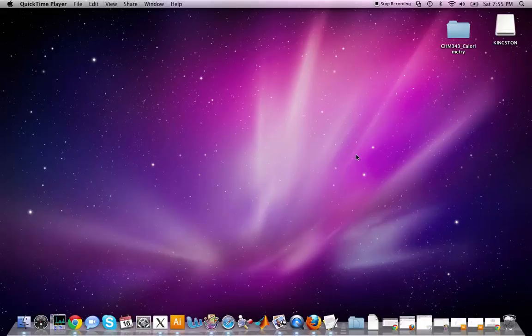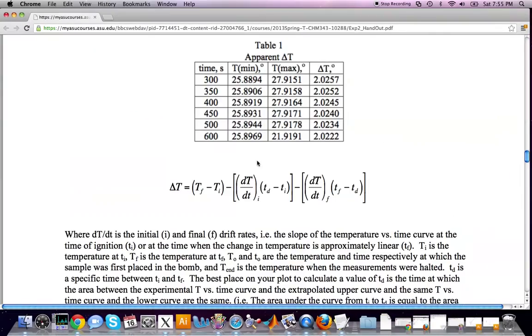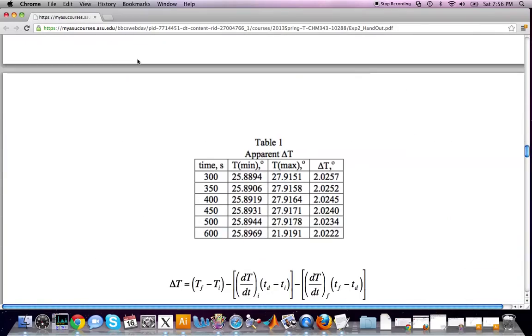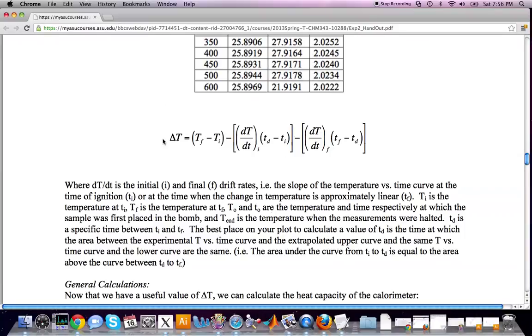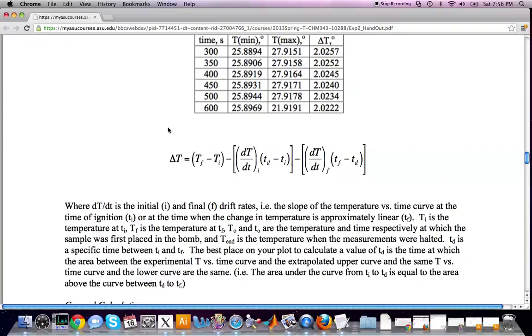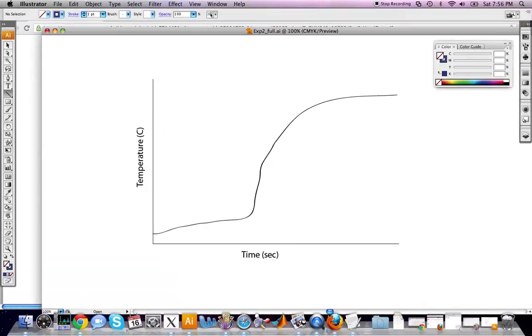Hi everyone, this is Steve Davidovsky, Chemistry 343 TA here at Arizona State University. In today's screencast, we'll go over how to find delta T when doing a bomb calorimetry experiment. You'll recognize this is the lab handout provided at the beginning of the experiment, available on Blackboard. Scrolling down to the section called Determining Delta T, you can see the equation for delta T. I'll go over what this equation means graphically.